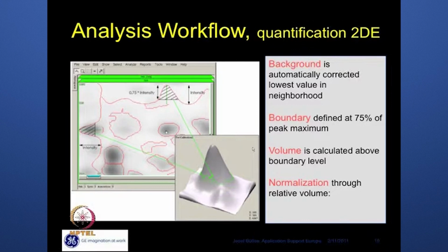So we can put this particular 75% for all spots, so nowhere is it going to affect your analysis, assuming that 20-25% is common for the background for all the spots. Right. That is what will be helpful.